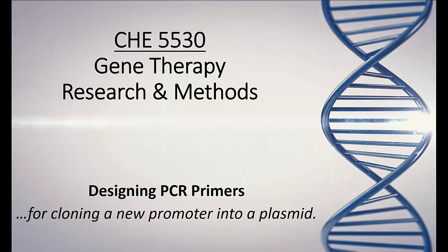Hi everyone. In this video, I'm going to show you how to design PCR primers, but not just any primers. In this specific example, I'm going to show you how to design some primers that will copy a sequence out of the genome, let's say a putative promoter, and then we're going to clone that sequence into an expression plasmid so that that promoter can, let's say, drive a gene for something like GFP.